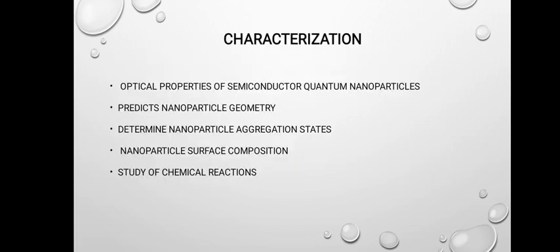And then characterization: optical properties of semiconductor quantum nanoparticles, then predicting nanoparticle geometry, then determining nanoparticle aggregation states, and then nanoparticle surface composition, and the study of chemical reactions.